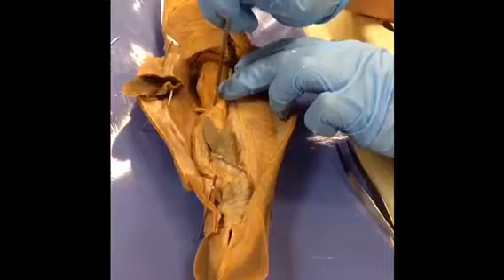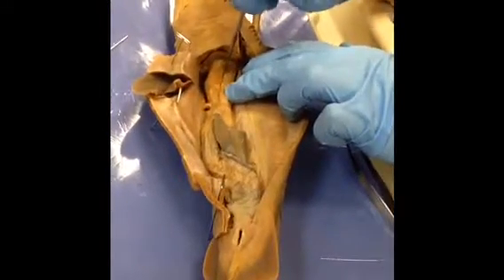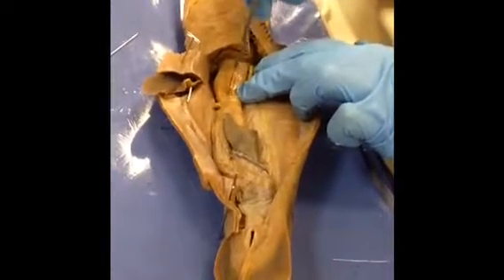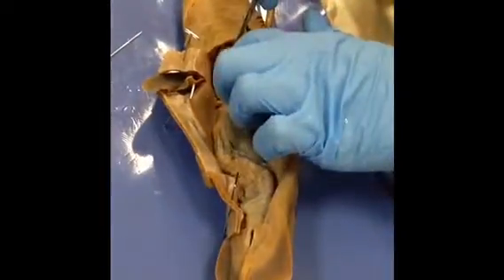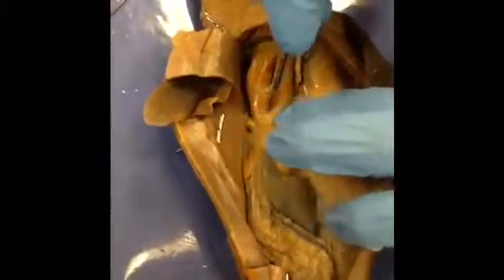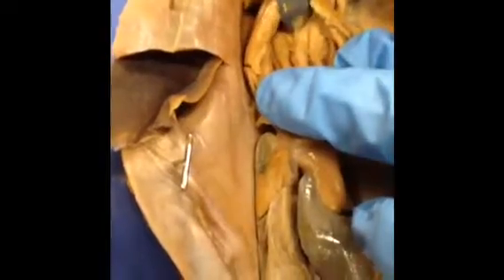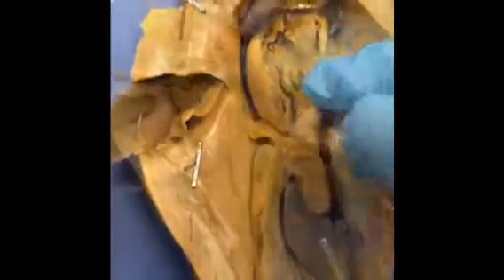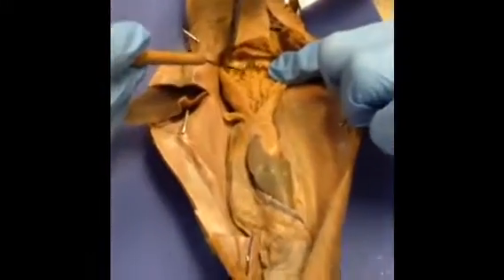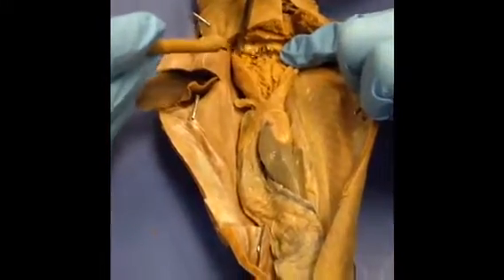We'll be taking an incision into the stomach. We'll just cut right through gently, making sure not to damage any of the internal structures of the stomach. In larger sharks like tiger sharks, there have been items found in there ranging from tires to license plates. The dogfish shark's diet includes Atlantic herring, Norway pout, poor cod, and various other small fish. The folds and creases inside of the stomach are called gastric rugae. They let the stomach expand to hold more food and help with mechanical digestion.